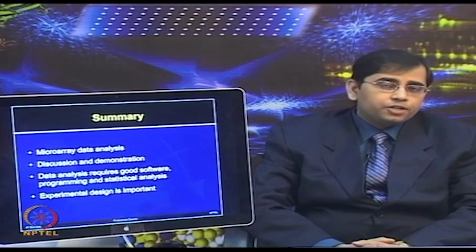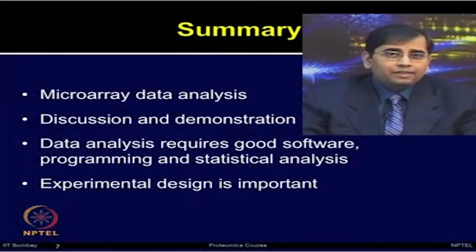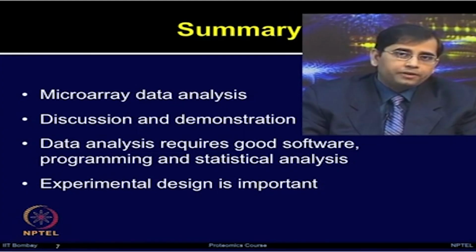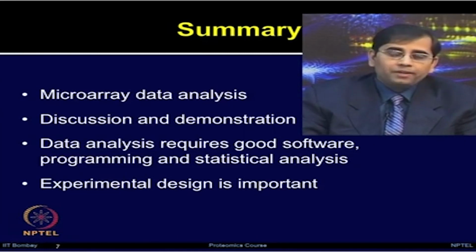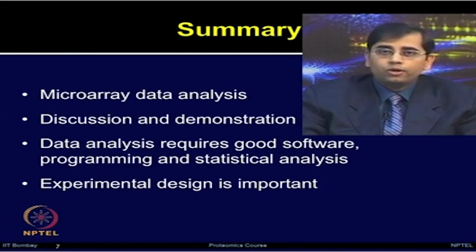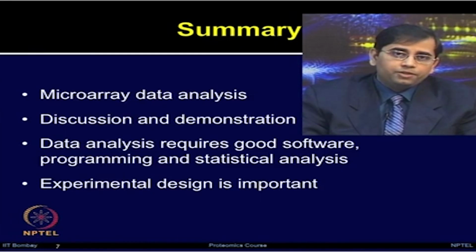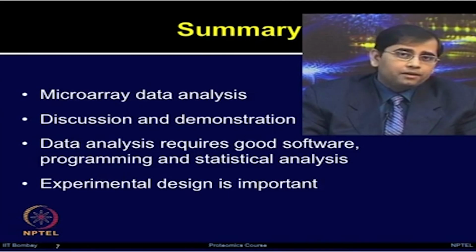So today we had a discussion about microarray data analysis. You also saw a demonstration of AQT software to learn about various parameters involved in performing this microarray data analysis. You must have got a glimpse of how complex this process is, and one really needs to put in several hours of hard work to obtain any meaningful biological information. The data analysis not only requires good software, it requires programming and very good statistical analysis.